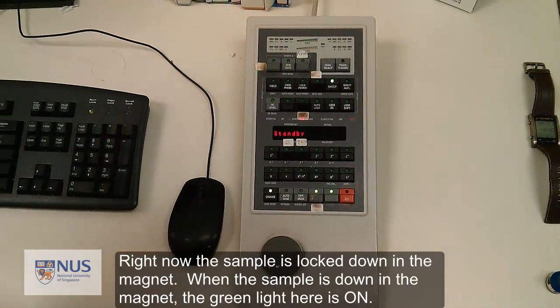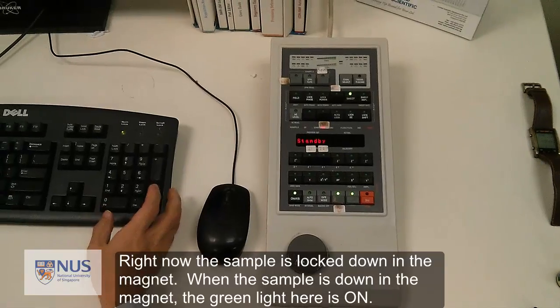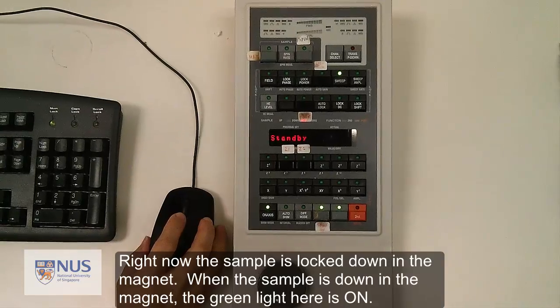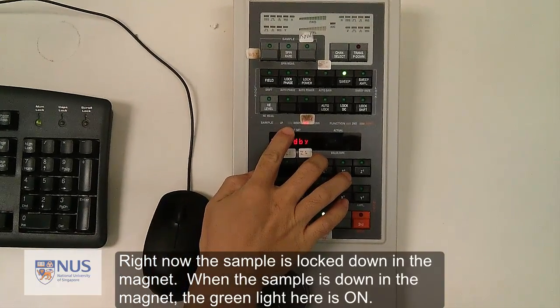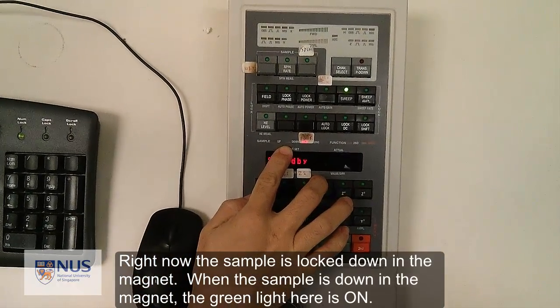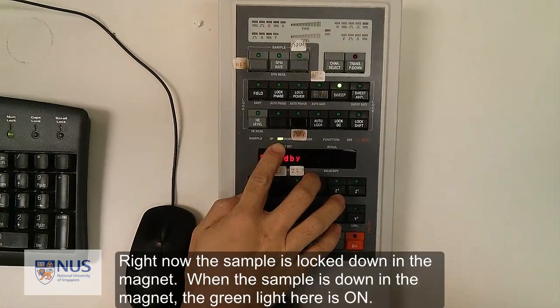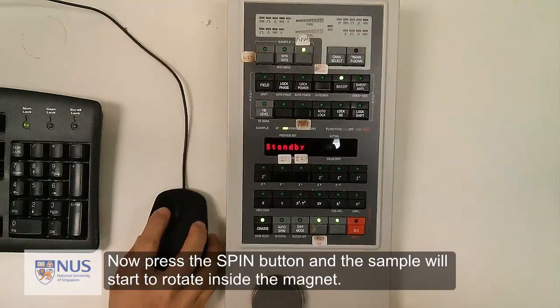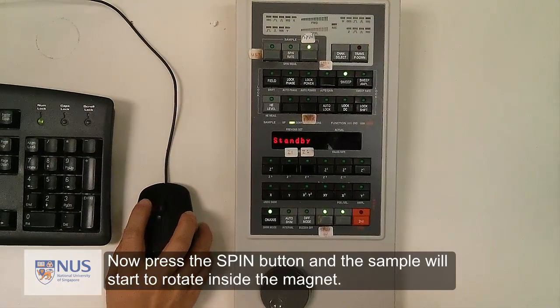Right now the sample is locked down in the magnet. When the sample is down in the magnet, the green light is on. Now press the spin button and the sample will start to rotate inside the magnet.